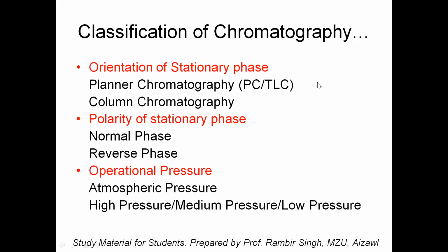And we can separate molecules like protein. You'll be surprised to know that nowadays, most of the chromatography we do for protein is on the reverse phase column only. Reverse phase HPLC.